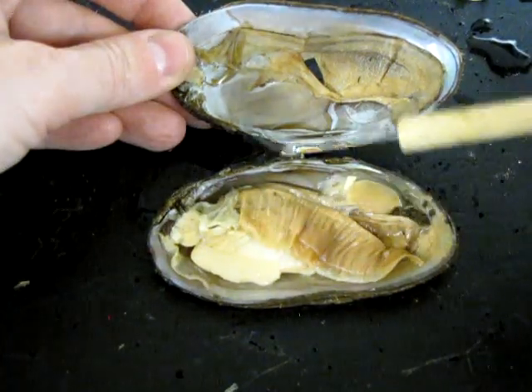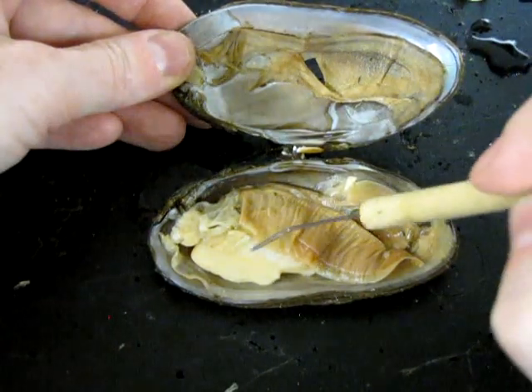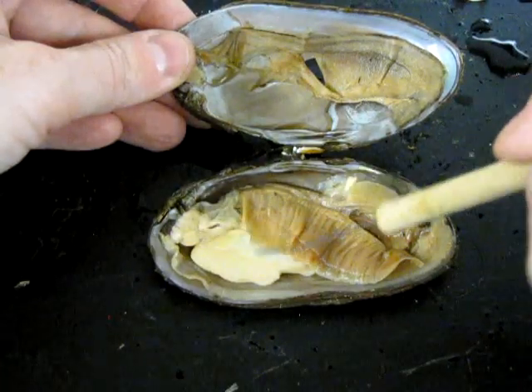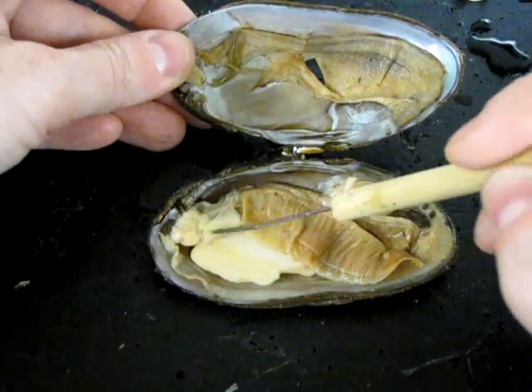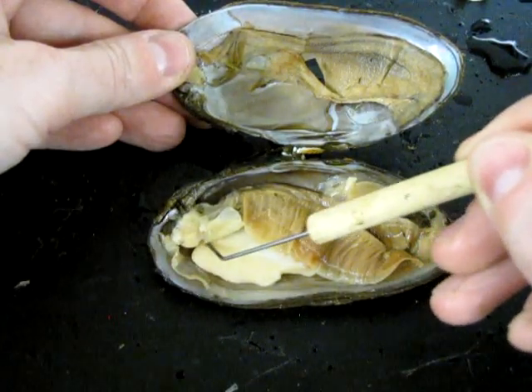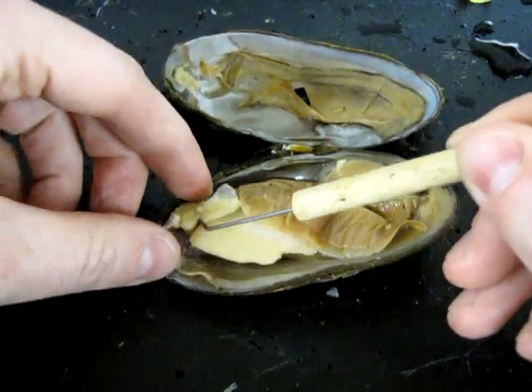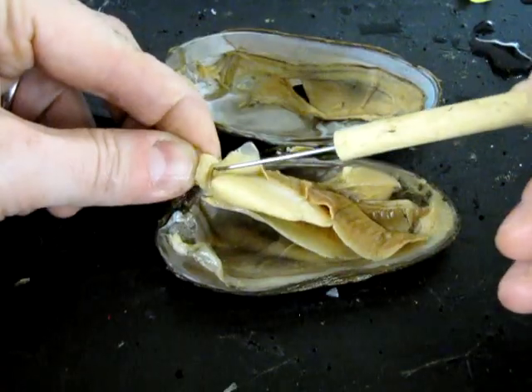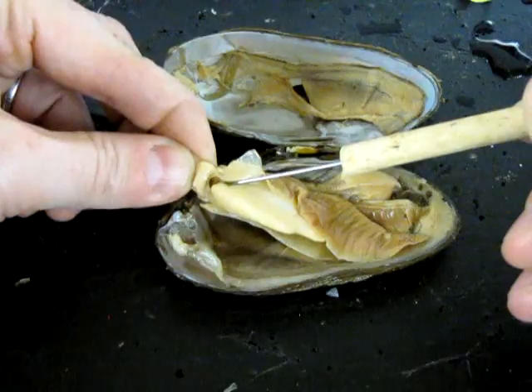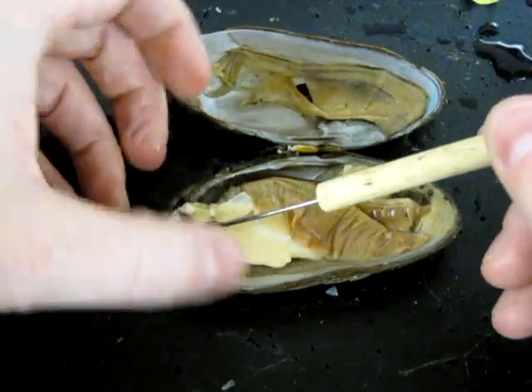In terms of feeding, they have a complete digestive system with both a mouth and an anus. We can look for the mouth by locating this structure called a labial palp — there's one on either side, just a thin flap of tissue. If we follow it down to the attachment point, that tells us approximately where the mouth is. The labial palps are sort of the entryway to the mouth.